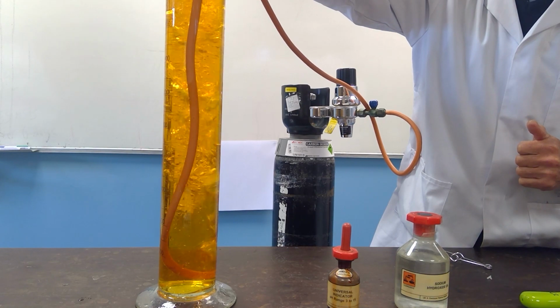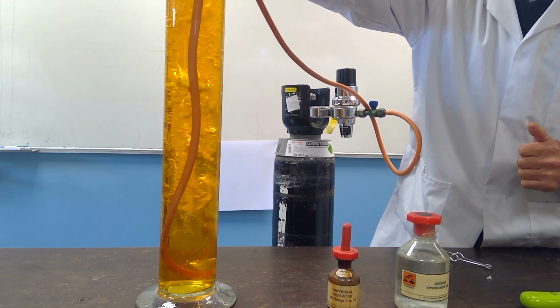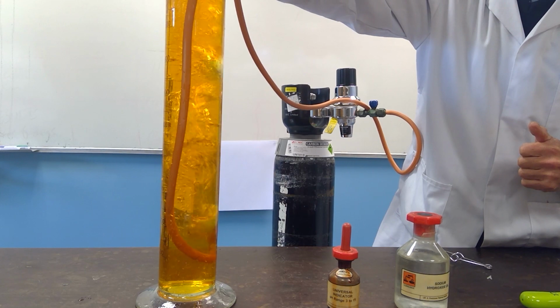The sodium hydroxide has been neutralized, the carbon dioxide has dissolved into the water, and we now have a pH of around 5.